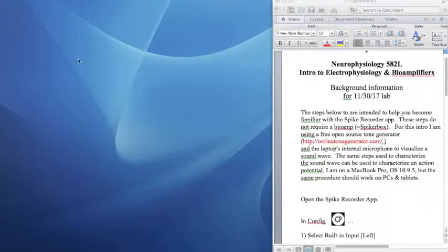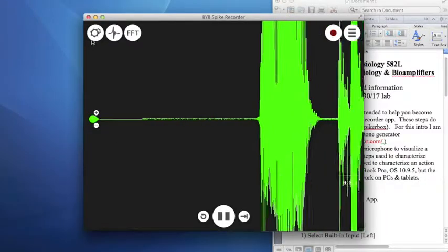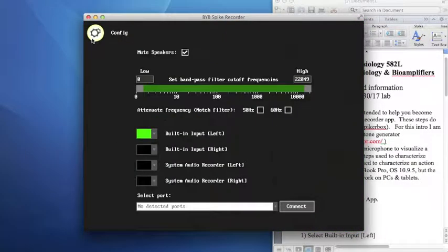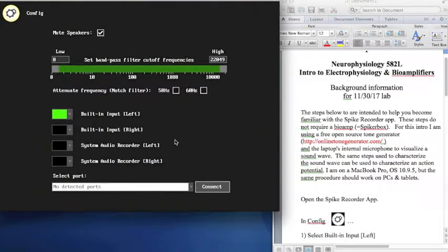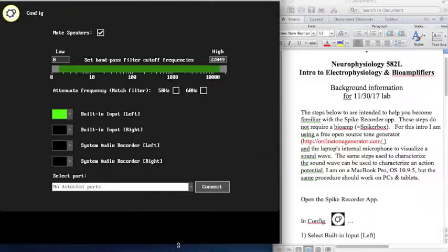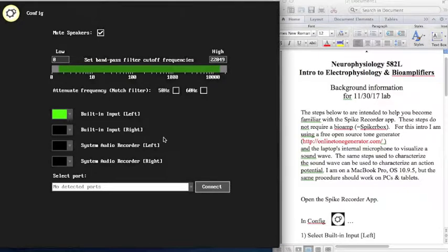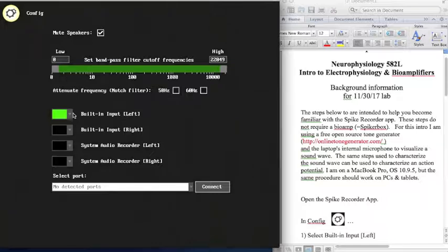Open the Spike Recorder application, and then click on the config icon, which is right here. A number of potential inputs will appear — in this case there are four — and an input can be selected by clicking on any of the colored squares in the dropdown box.